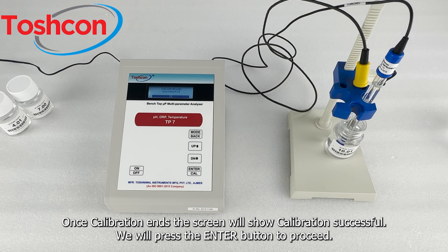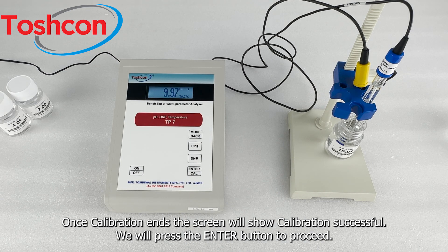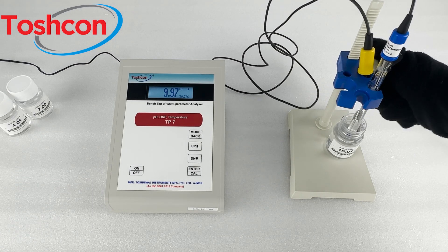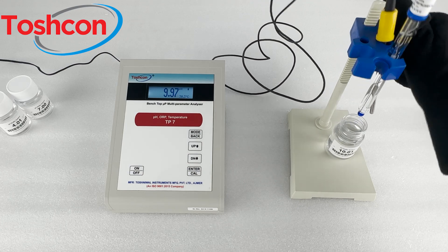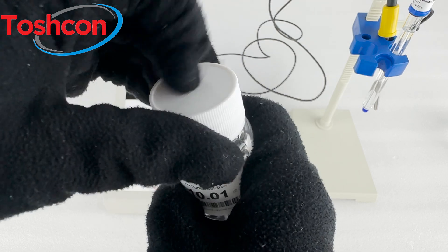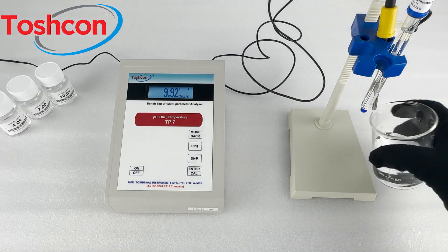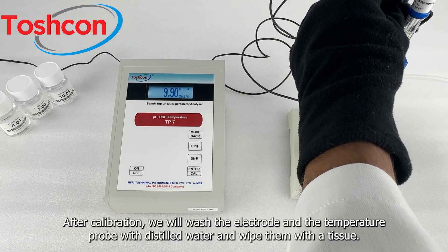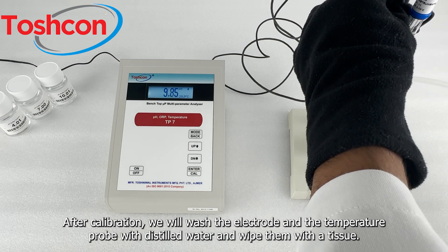Once calibration ends, the screen will show calibration successful. We will press the enter button to proceed. After calibration, we will wash the electrode and the temperature probe with distilled water and wipe them with a tissue.